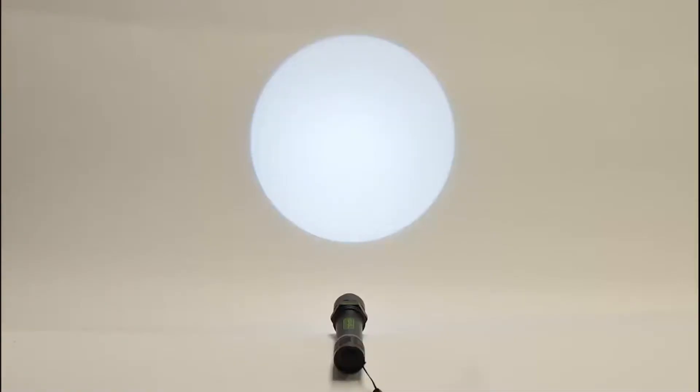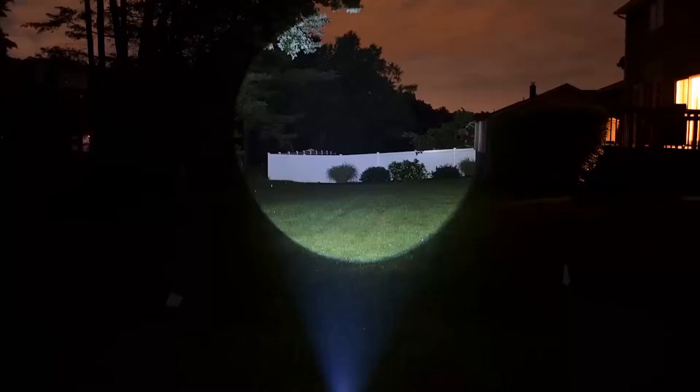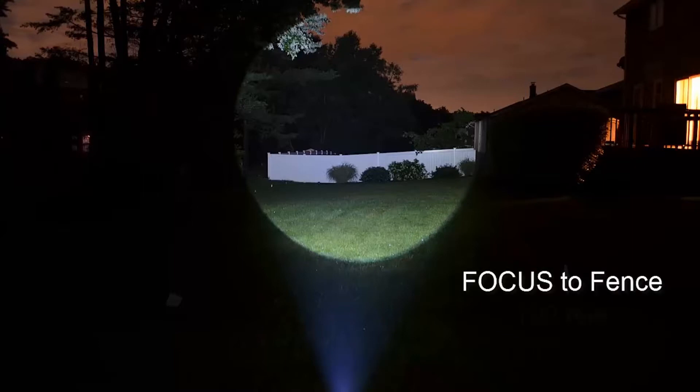The Focus sets itself apart due to its superior optics. Unlike other LEDs, it has an even homogeneous beam with a defined edge, providing great illumination for photography and eliminating potential hot spots. It also has great beam projection for an LED, which is critical when searching for hairs or other trace evidence.